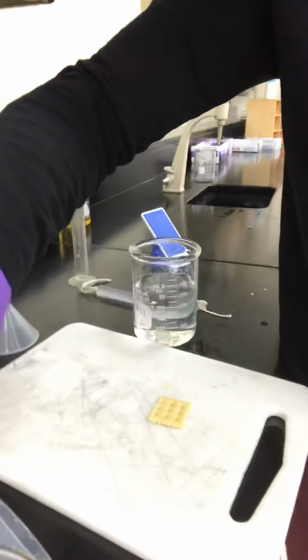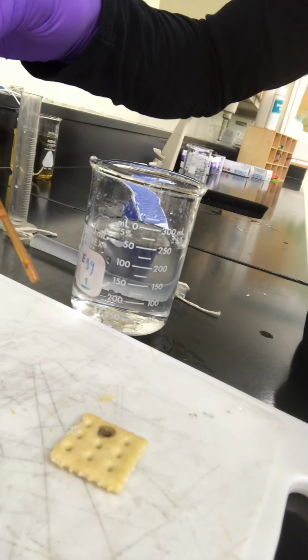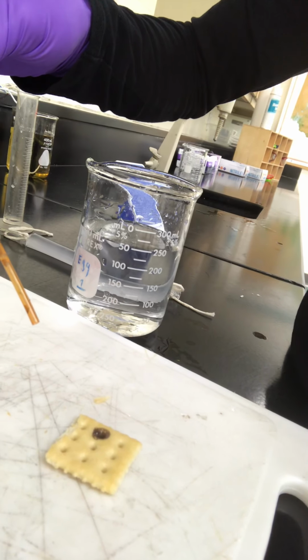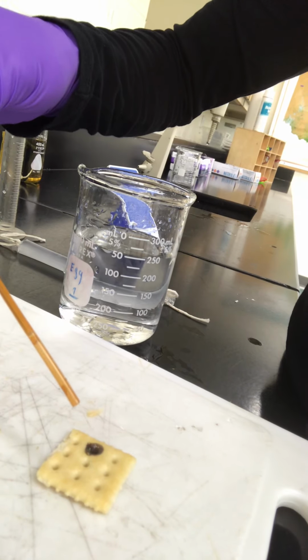So we know that starch is a carbohydrate, which is a macromolecule, and so I thought I'd do a quick little demonstration. I've got a cracker here, and the cracker has starch in it, but to double check, we're going to use iodine. I'm going to put just one drop here. You see? And make some observations. What happens? The cracker turns black. So iodine is an indicator for starch. Iodine turns black in the presence of starch. So that's just kind of a control that we can do.